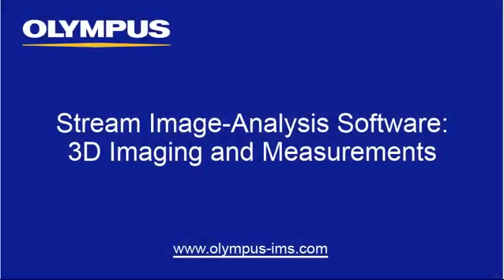This tutorial is one of many instructional videos presented by the Olympus Industrial Equipment Group. This tutorial video will provide you with detailed instructions to capture 3D images and to perform height measurements within the Surface View add-in module for the Olympus Stream image analysis software.